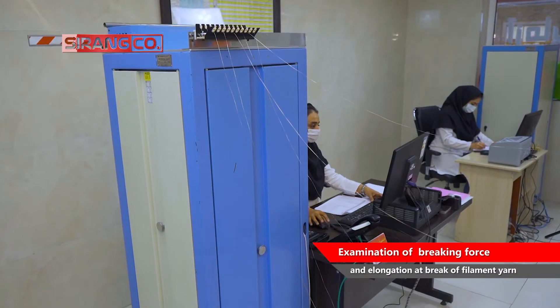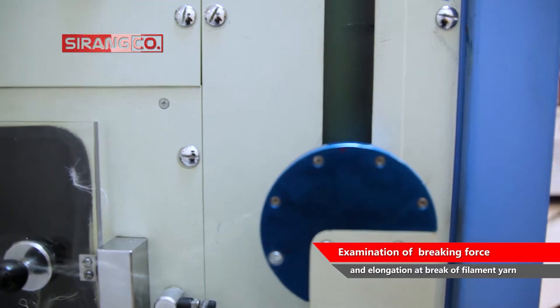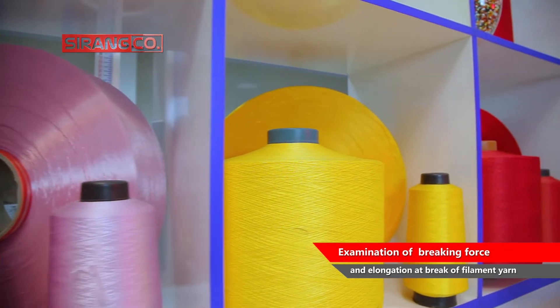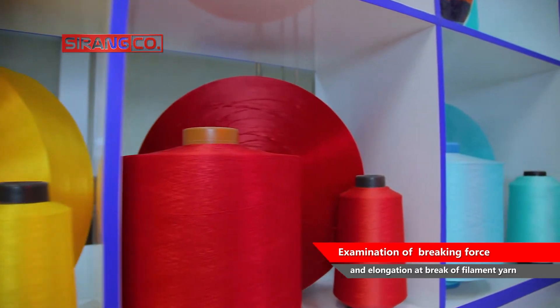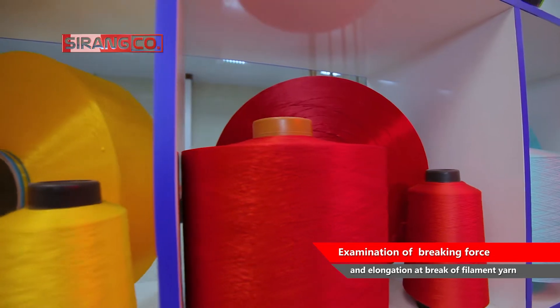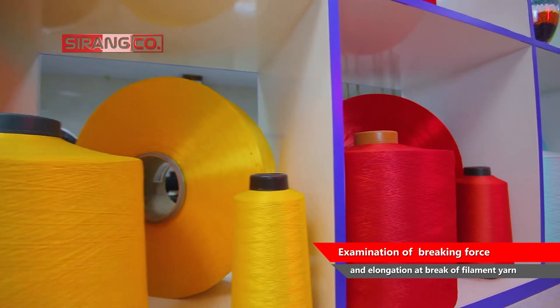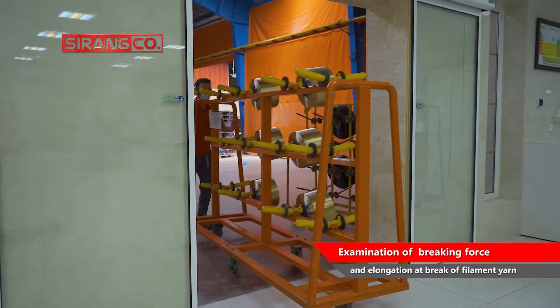Examination of breaking force and elongation at break for filament yarns. Specific stress, elongation at break, and work of rupture are the rupture characteristics of yarn and fiber, each of which can be decisive, important, and effective based on the final application of the yarn and fiber.